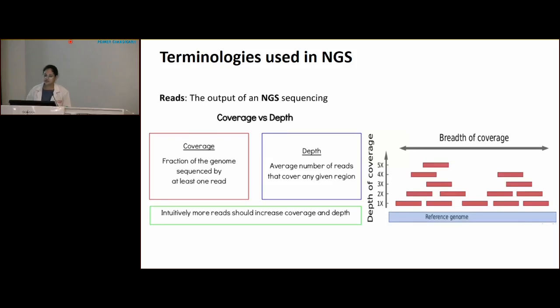Most commonly, when you get exome sequencing, we use around 90x or 100x, which gives you confident data. But when you have a variant with depth less than 25, you have to take it cautiously, and you should always ask for Sanger validation.